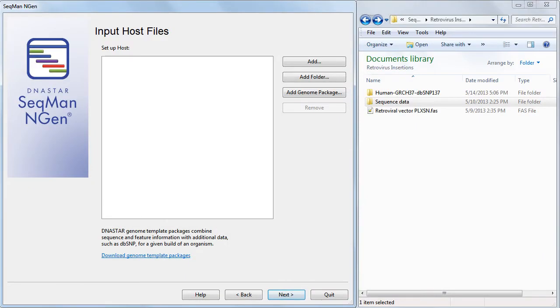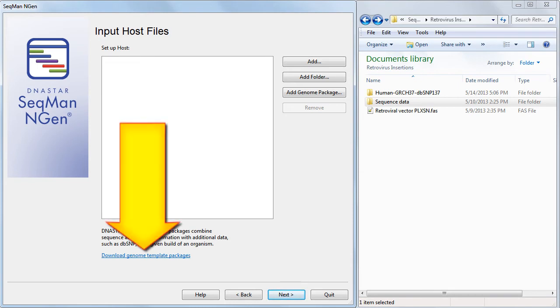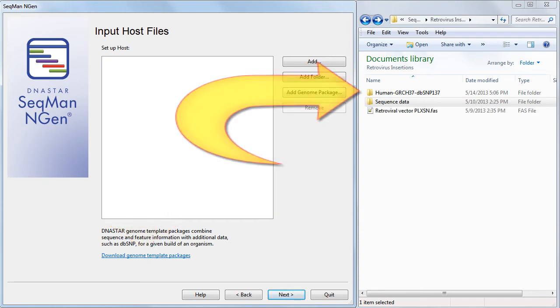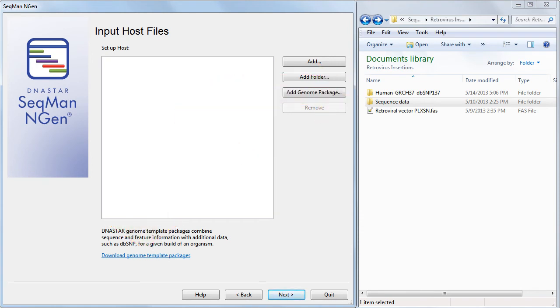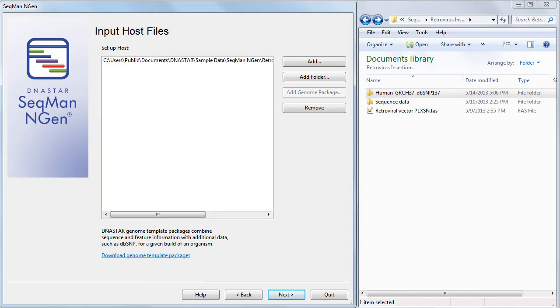The Input Host File screen is where we'll input the host genome, in this case, human. I earlier used the link to download a free genome template package from the DNA Star website, then extracted and saved the folder on my hard drive. I'll just drag and drop the package onto the NGen wizard.